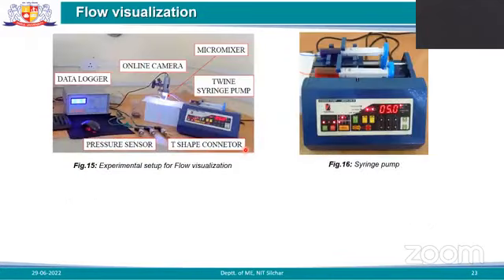And finally, we have used a syringe pump to give the particular flow as per our requirement. We added two different types of, we added water only. We have given two different colors here to see the effect. And finally, whatever images we got were recorded by the online camera system.